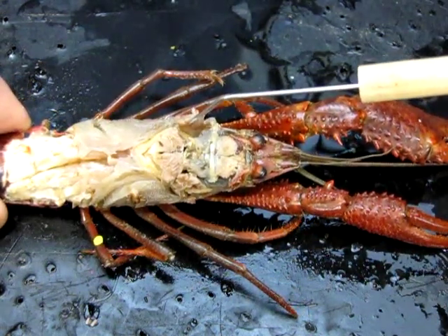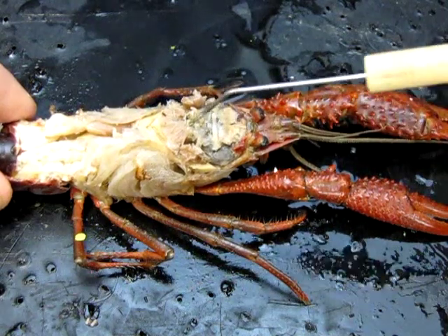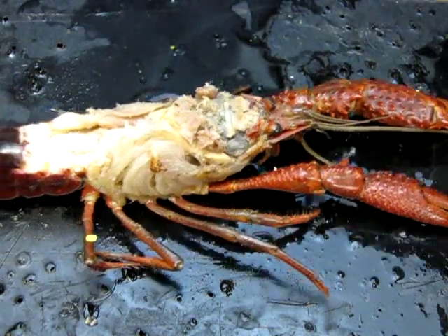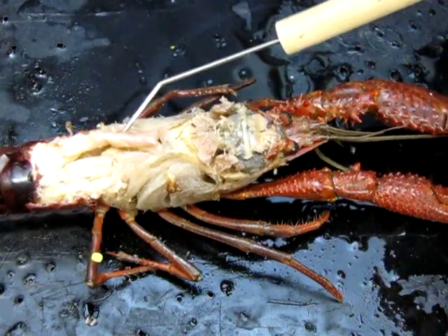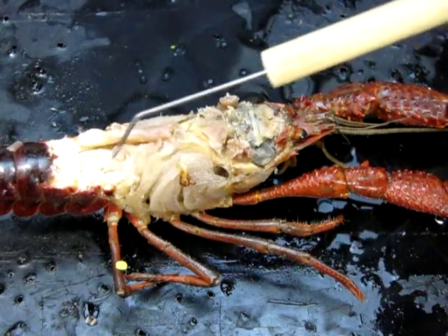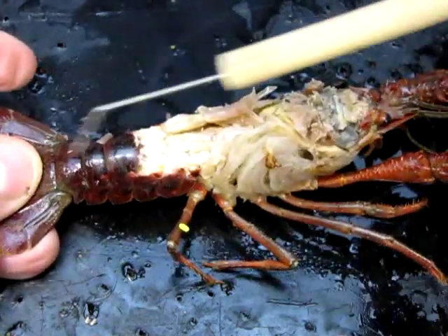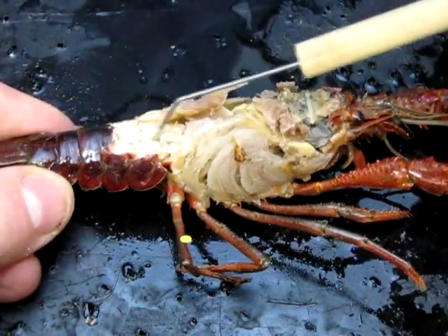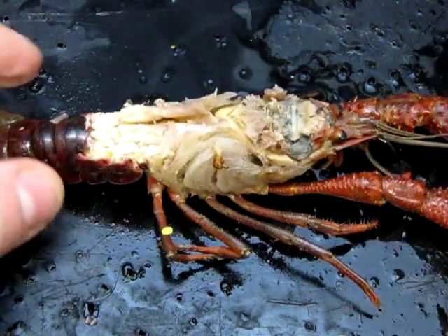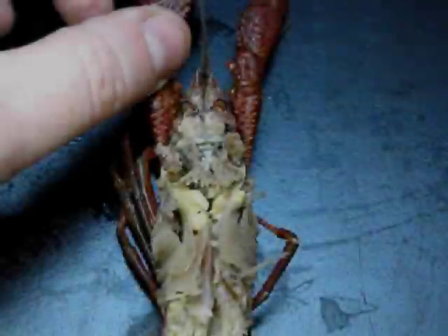On either side there's a nice little round muscle here and another one on the other side. Those are called mandibular muscles, and those are involved in opening and closing the mandibles — so the mouth parts. Moving further down the body, there's a nice long muscle — that's the abdominal extensor muscle, responsible for extending or straightening the abdomen. Along the sides there's another set called the abdominal flexor muscles, responsible for curling the tail under.